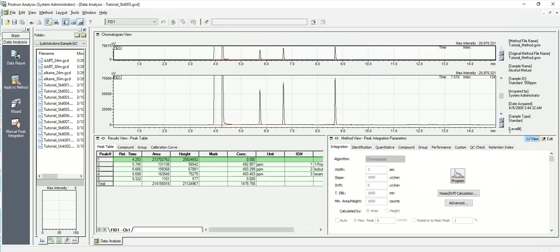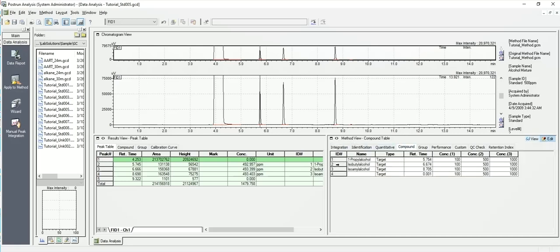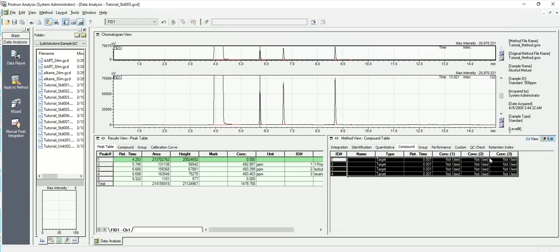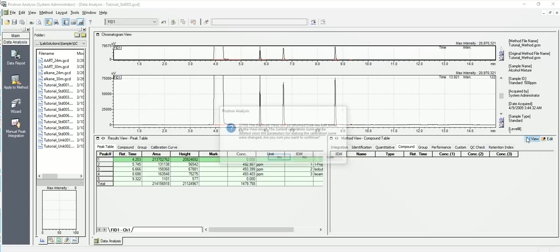Okay, then we have three peaks of interest. So over here, I view, first thing I'm going to do here is put an edit mode here and I'm wiping out my compound table because we're going to start from scratch, because you won't have that compound table there.